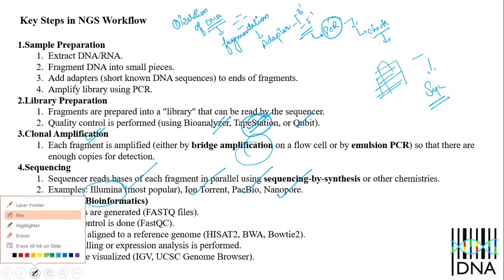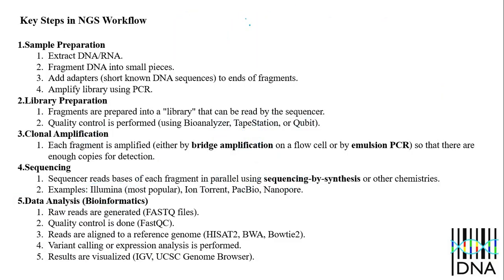Now, after the Illumina sequencing, we get the data in a FASTQ file.